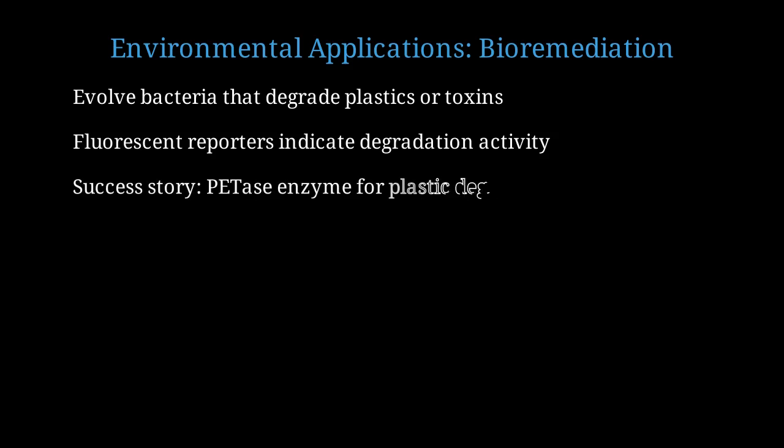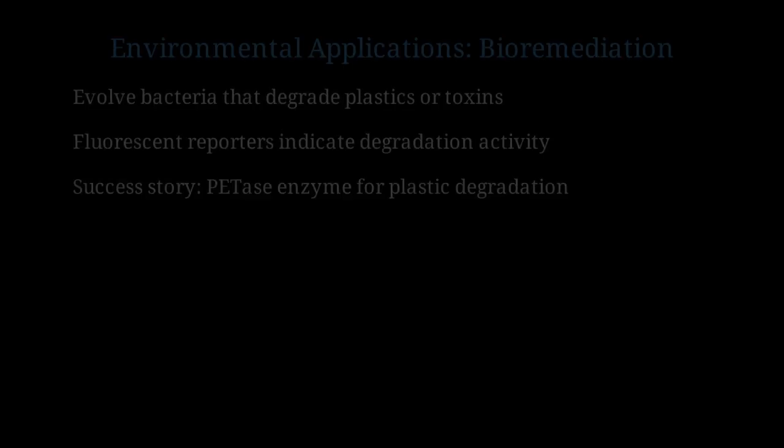A success story is the evolution of PETase enzymes that break down polyethylene terephthalate plastic. Researchers achieved 100-fold improved activity using droplet-based directed evolution.